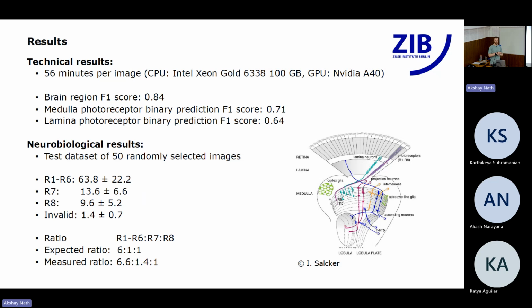training data, I would say that just creating training data for one image, and we're not talking about actually mapping the synapses to the layers of the medulla and so on, takes at least 10 hours. And probably if we're talking about writing down all the results and putting them in an understandable form, probably double that.